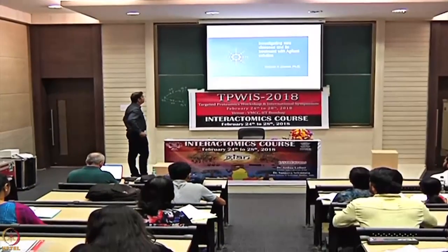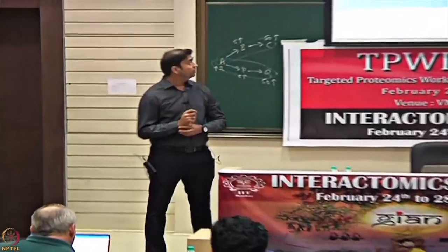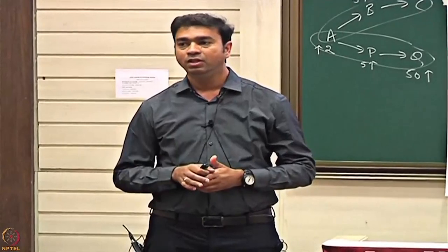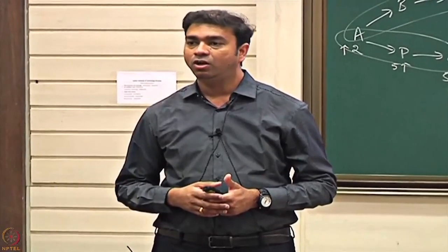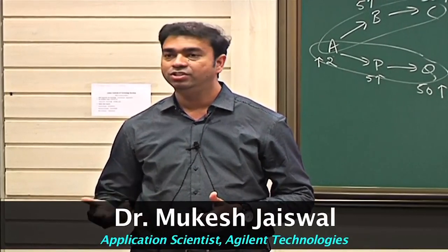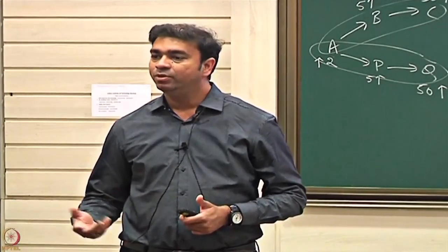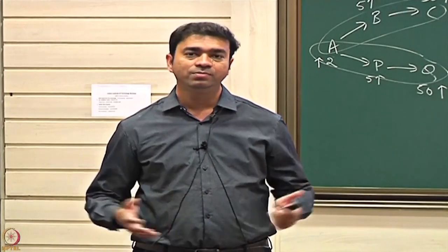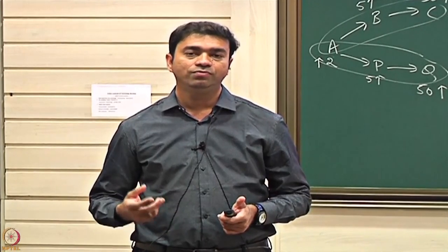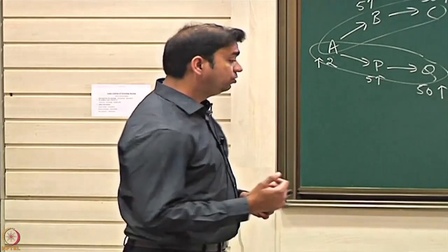Okay. So, today we are going to talk about investigating rare disease and its treatment with the Agilent solutions. I am going to cover what rare diseases are, how they can be diagnosed by the NGS solution, and how we can give the treatment to the patient. We have some solutions where you use Agilent solutions for the diagnosis of rare disease and its treatment part.